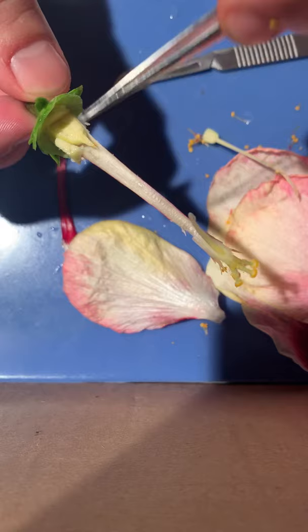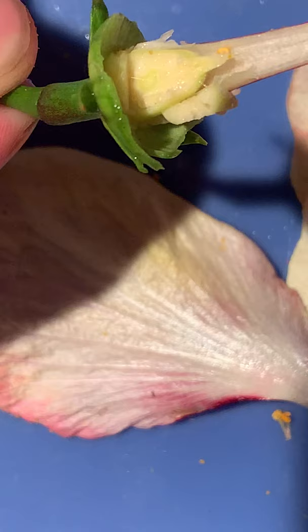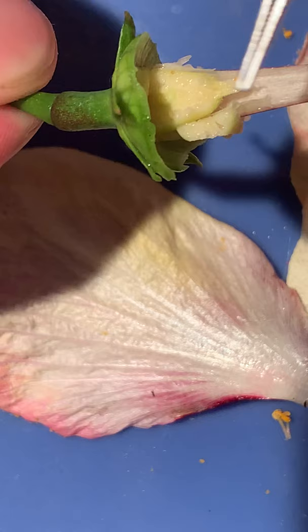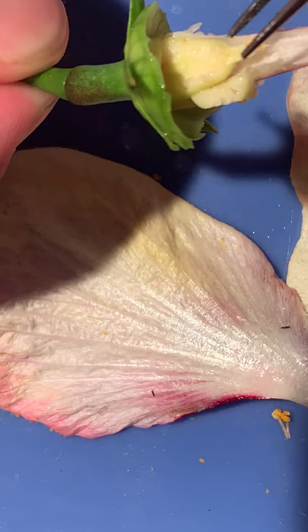Now if you get a closer look — I'll zoom in — you could actually see the ovules right here. These are ovules which are fertilized by the sperm to make seeds. So the ovary contains all the ovules, and the sperm goes down the pollen tube into the ovary and fertilizes the ovules, which later become seeds. And that covers everything as far as the flower goes with all the reproductive structures.